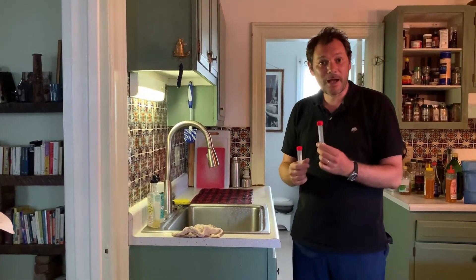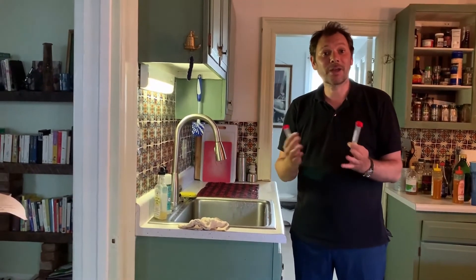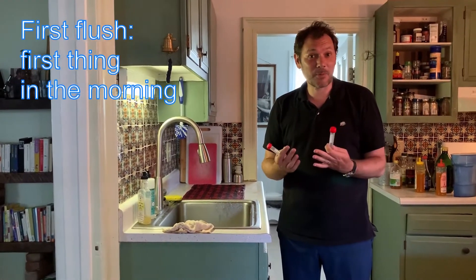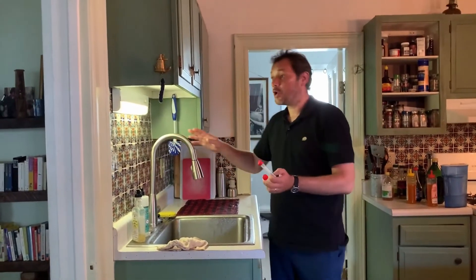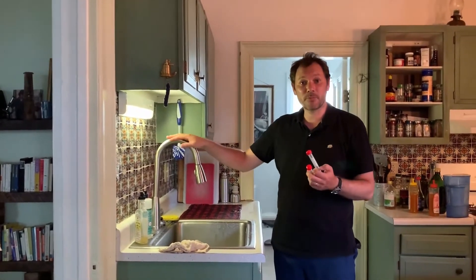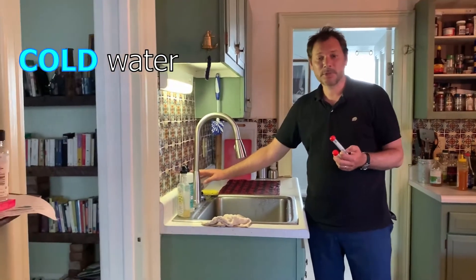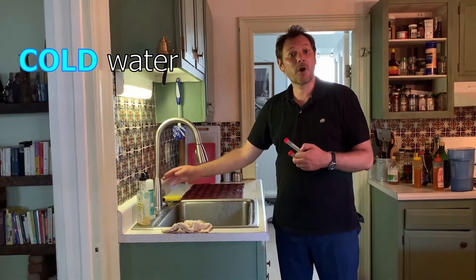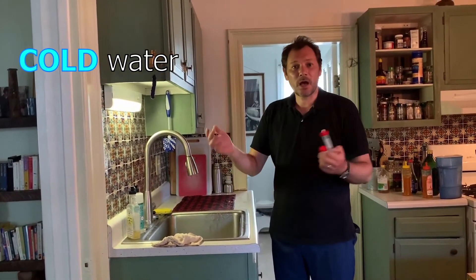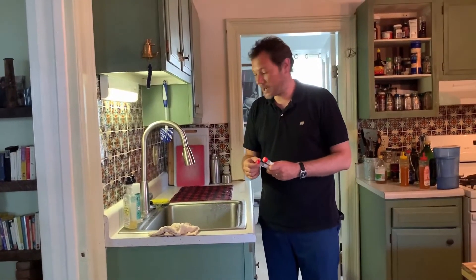The first flush happens when the water was not used for a very long time — for example, first thing in the morning. We want you to select a tap, it can be your kitchen tap or your bathroom tap, whichever tap provides drinking water, and we want you to use only cold water. The reason is that cold water comes directly from the city system; hot water sometimes is stored in a separate basin in your house or apartment complex.